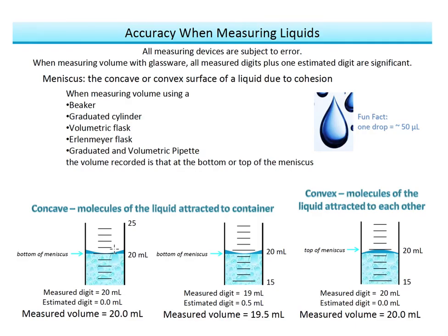So here is what I really wanted to show you, because this is what people have problems with, and it's measuring using tick marks. So the first thing you have to ask yourself is, what is this tick mark reading? If the tick mark is reading to the ones, which it is here, it looks like, because it's going up to 20 and then 21, 22, 23, 24, 25. Sometimes you have to count.